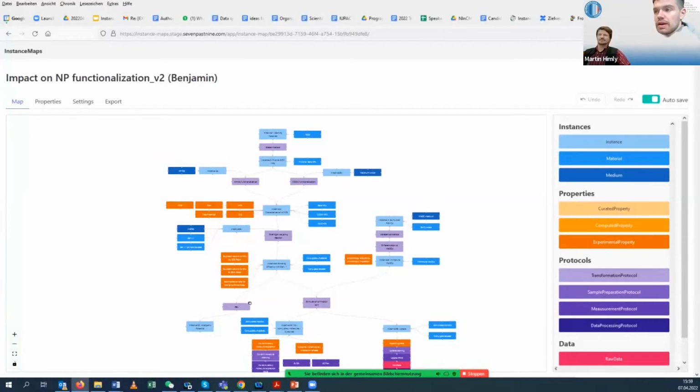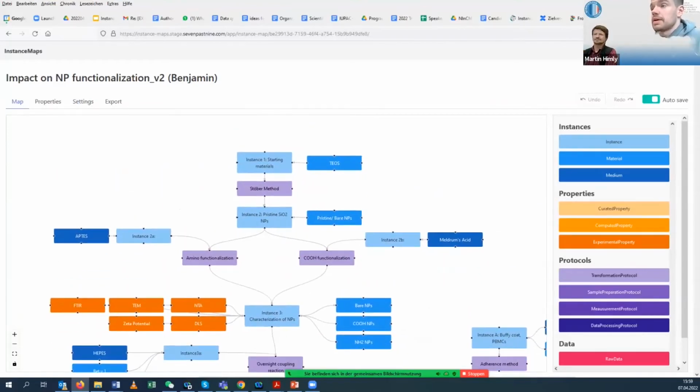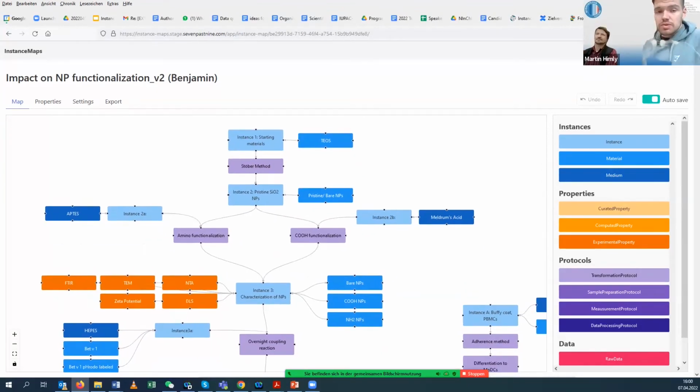And then we further analyzed it and tried to find structural alterations, which I will get more into a little bit later in detail. So in the beginning, as a starting material, as Thomas already said, with the different color coding, we tried to implement and utilize it.